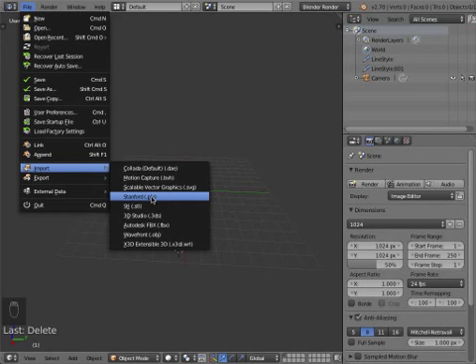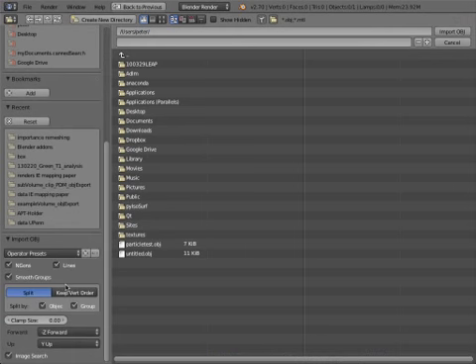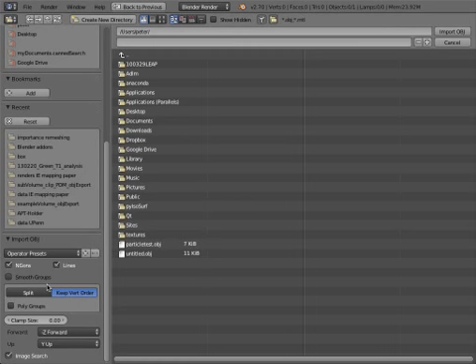And again, we're going to be using PLYs and we're going to be using OBJs. And we're going to start with an OBJ. When we load in the OBJ, we'll get some options here. The important option for us is keep vertex order, because otherwise this program is made to deal with meshes and not with point cloud data. If we don't keep vertex order, it will only keep the vertices that belong to triangles, which in our case are none at all, because we're loading in point cloud data. So you click keep vertex order.